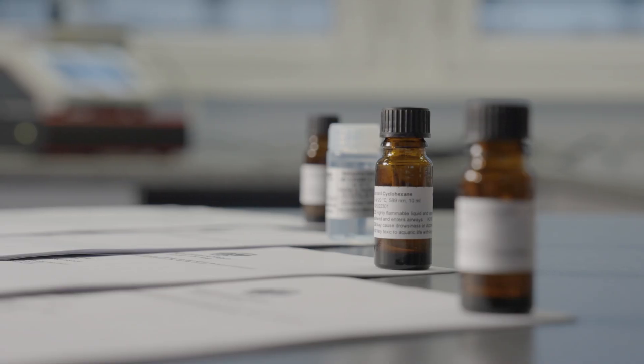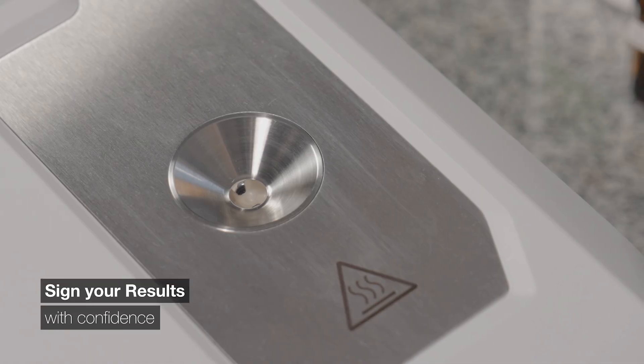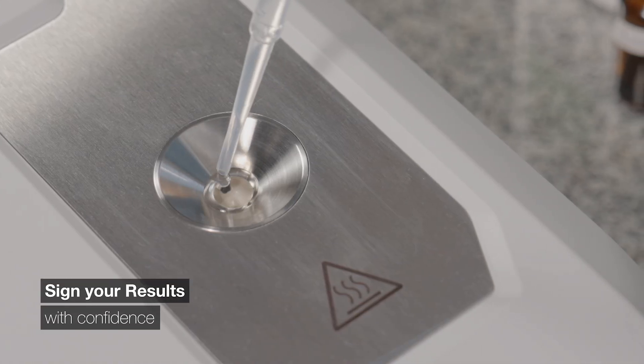And our after-sales service maintenance keeps them in top shape. Because we want you to sign your results with confidence every single day.